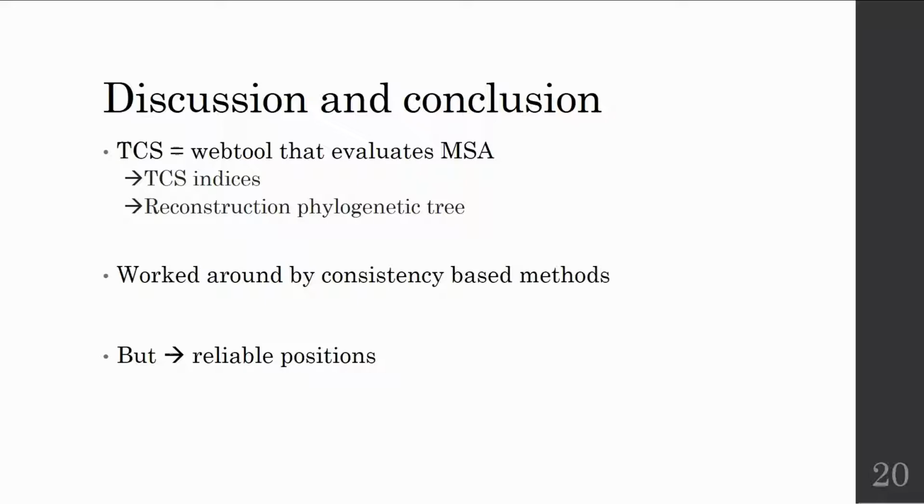So if you want to create a more accurate multiple sequence alignment, it's probably better if you just use one of these consistency-based multiple sequence aligners. But what it is very useful for is to see which of these positions are reliable and which not.